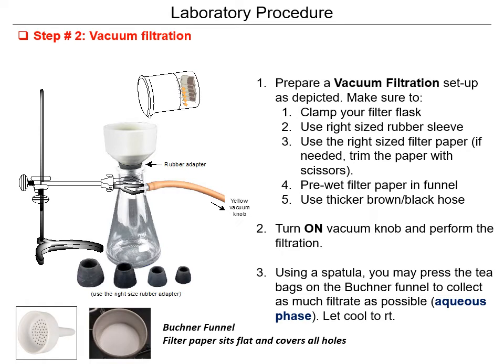Then, using a spatula, you may press the tea bags on the Buchner funnel to collect as much filtrate as possible. This filtrate is your aqueous phase.